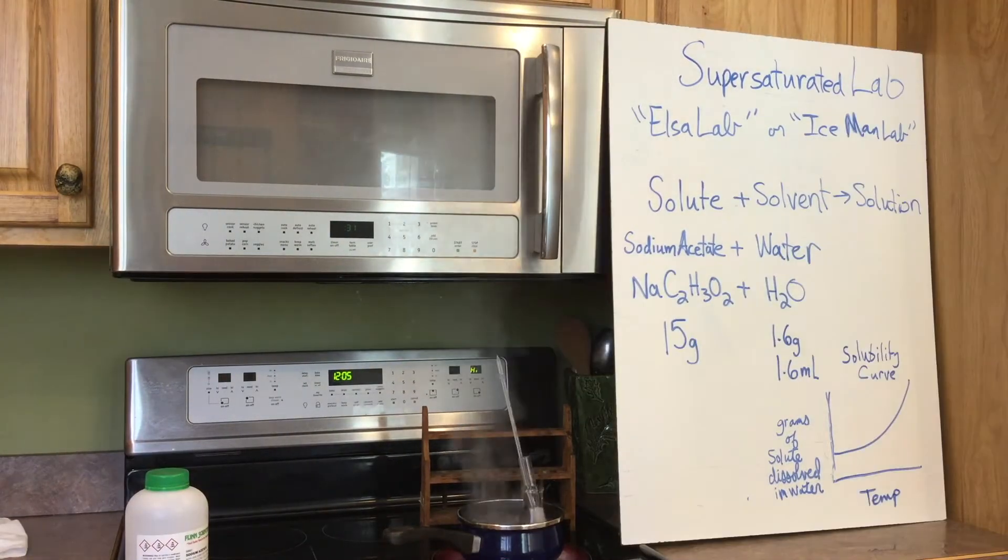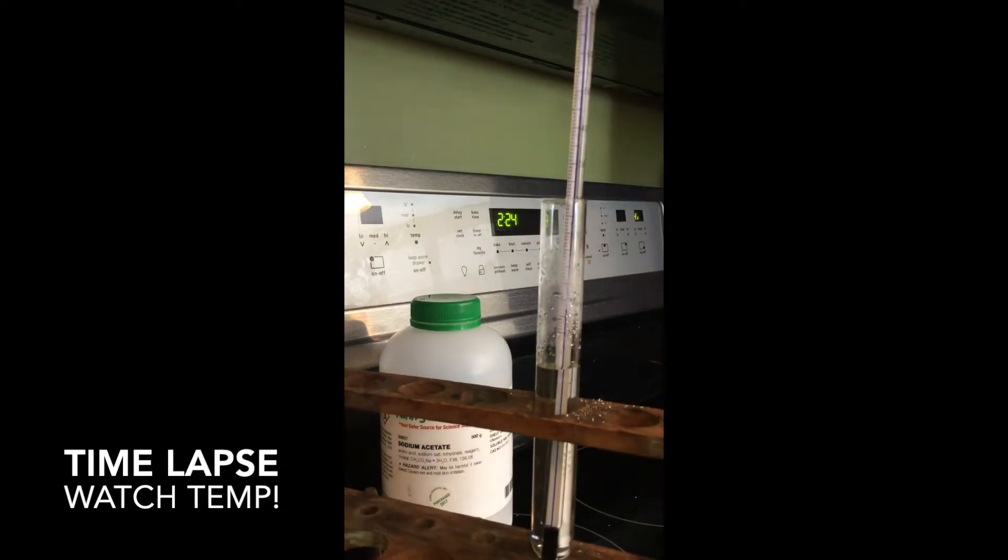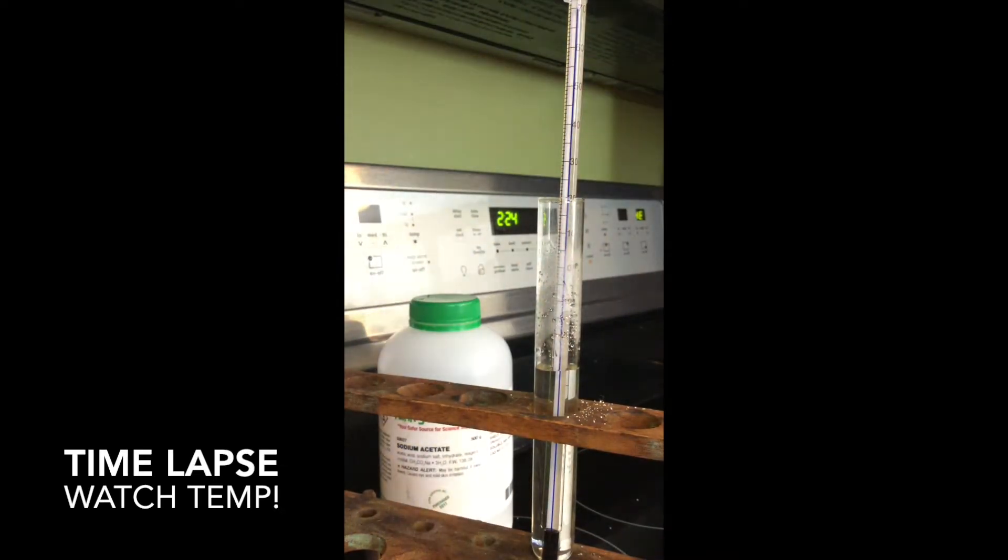Now I've set up a water bath to try to heat this solution up. As it got warmer, all of the sodium acetate dissolved and we're left with a clear solution. Now as I move it over to the test tube rack, you can't see the starting temperature, but it actually started at about 80 degrees. Now we're going to let it sit there and let it slowly cool down and see what it looks like at the end.